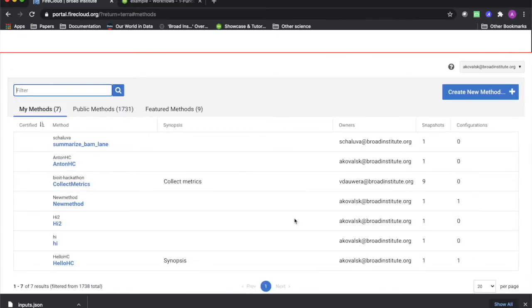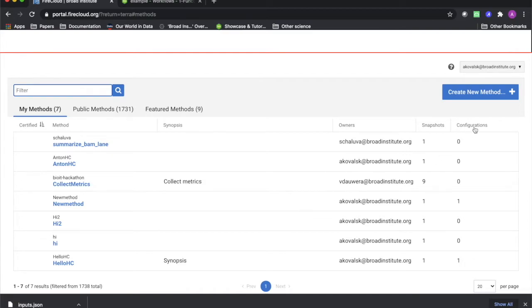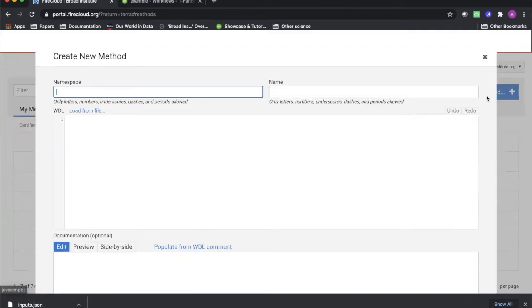Once you're logged into the repository, you can upload your own WDL file by clicking Create New Method on the right. Clicking this button will call a popup that gives you the option to either upload a WDL file from your computer, or type out or copy-paste the WDL code directly.